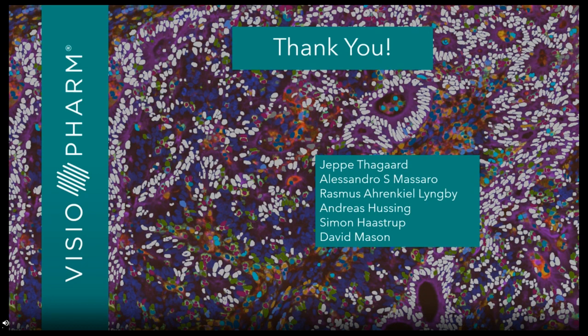Okay, our next question is: how does the cell segmentation work? Based on nuclei expansion or also by other means? Yes, so the current cell segmentation works on the expansion of the nuclei. So this is the first thing that we do. We can also incorporate training that you learn from the lineage markers, but this is something that you would have to do on your own currently. So the algorithm doesn't know this yet.